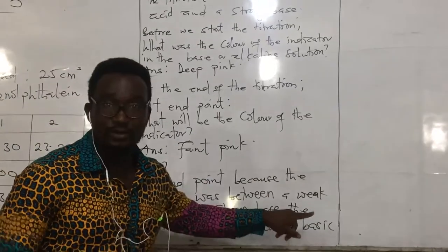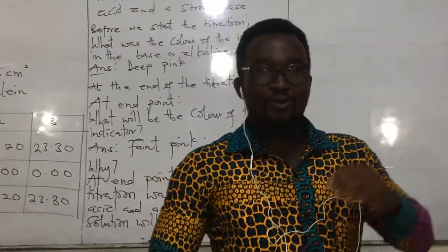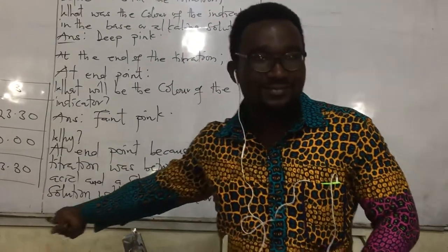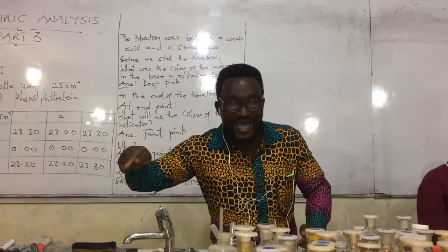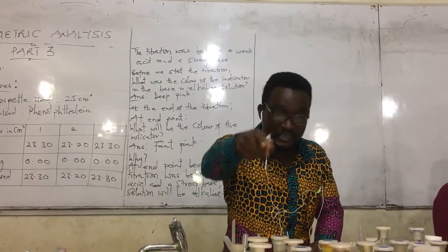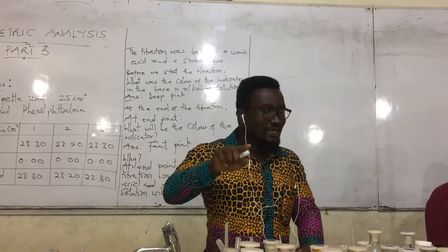That is why the color should still be what? Faint pink, not colorless. If you record colorless, you are indicating two things. It is either you have run more acid than the base, therefore the solution becomes acidic, which is wrong. So if you get colorless, it means your solution is acidic, which means the pH of that solution is not from 8 and above, where phenolphthalein can work best. It means you are wrong from the theory. That is why I said, my various examiners, listen to this very carefully.